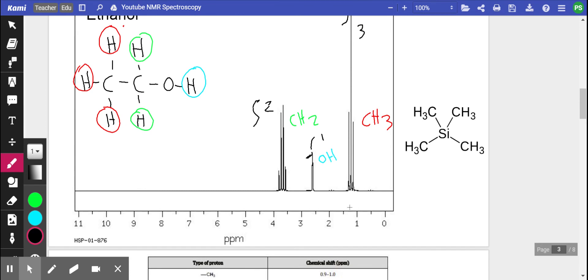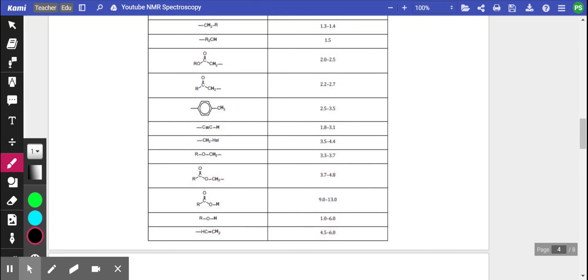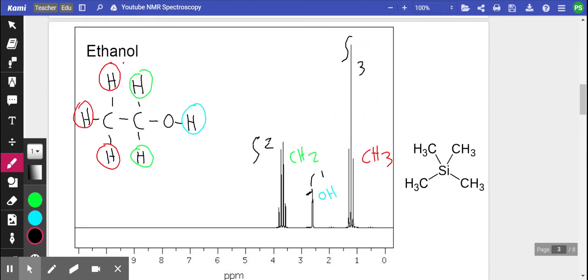Now the OH group is quite broad but it is between 1 and 6. That really depends on the presence of other electronegative elements around it. So we see it at 2.5.